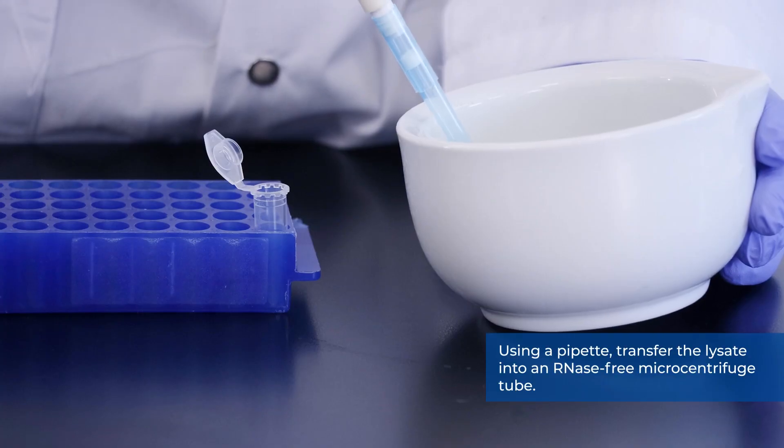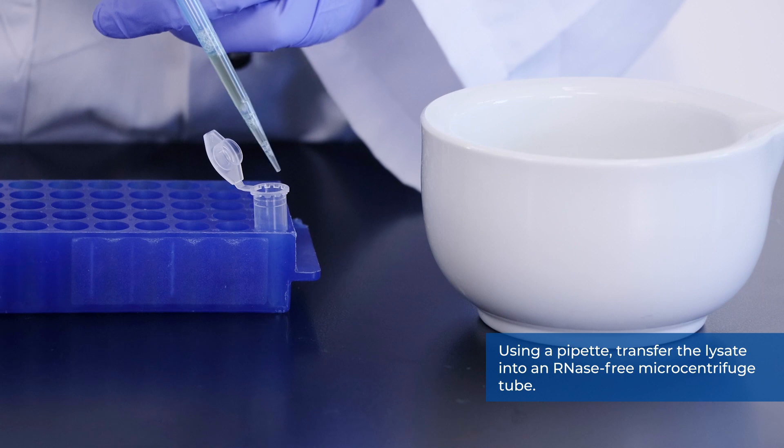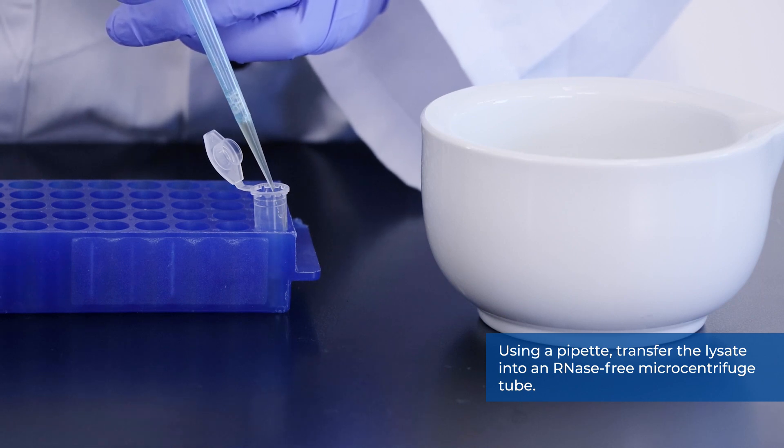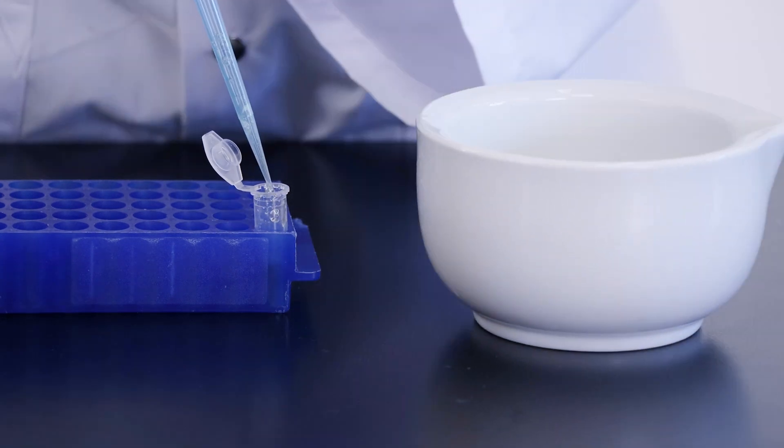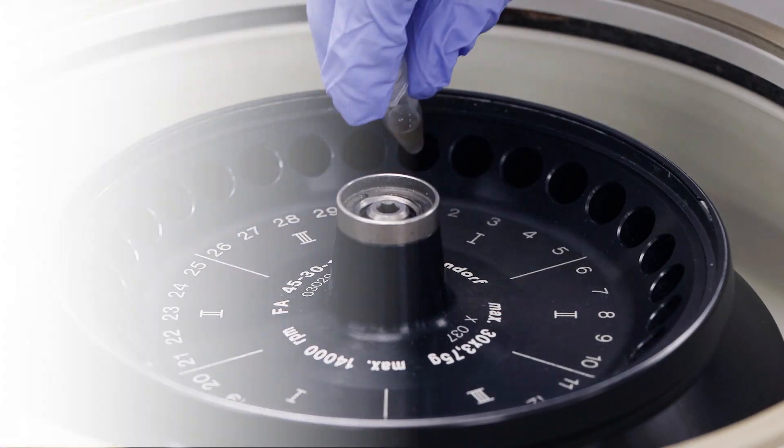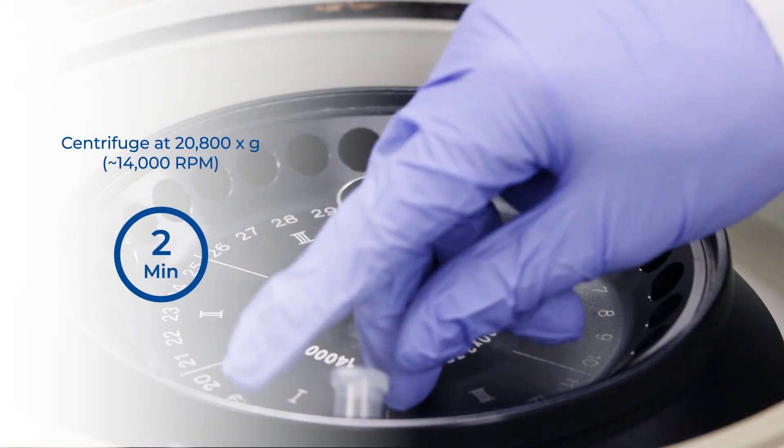Using a pipette, transfer the lysate into an RNase-free microcentrifuge tube. Spin the lysate for 2 minutes to pellet any cell debris.